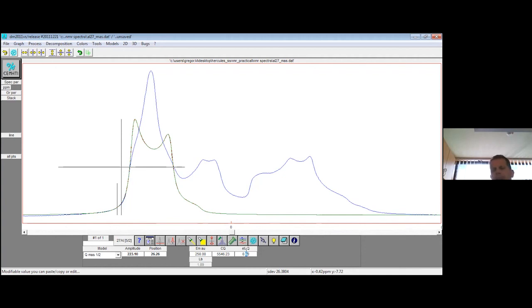eta q, which is asymmetry. And such a shape with two distinct horns at almost each side of the line is typical for eta close to 0, whereas where we go to eta close to 1, we typically get a single horn in the middle. And this one, which we have here, is closer to this shape with eta 1 than the shape with eta 0.